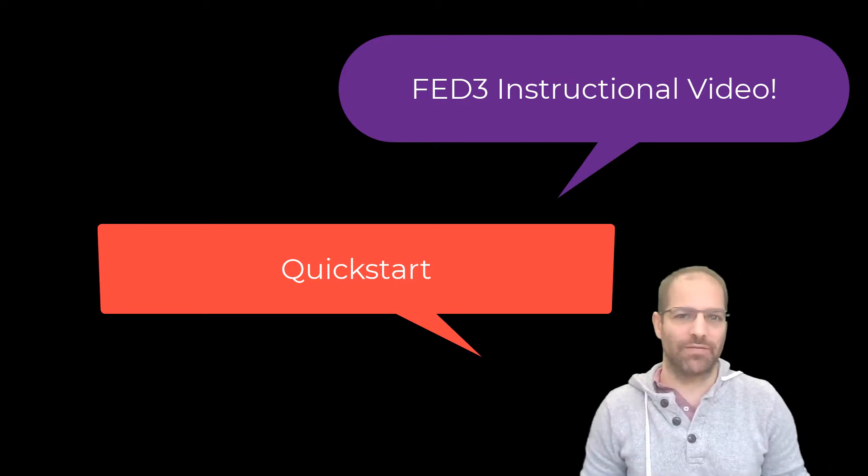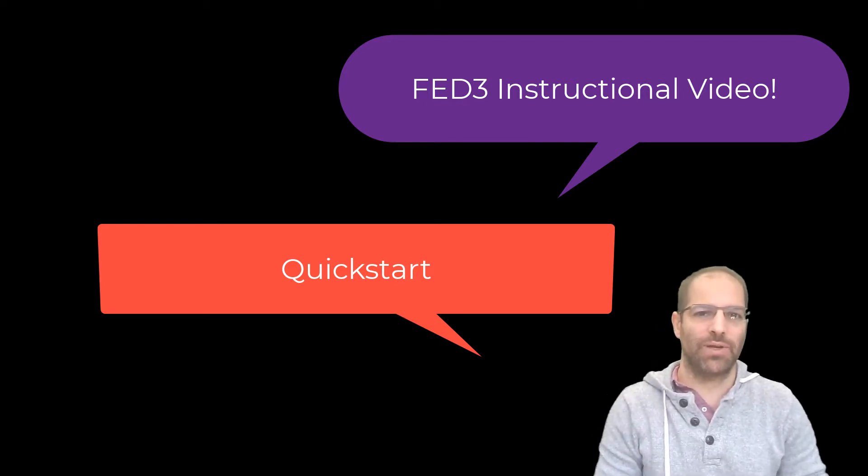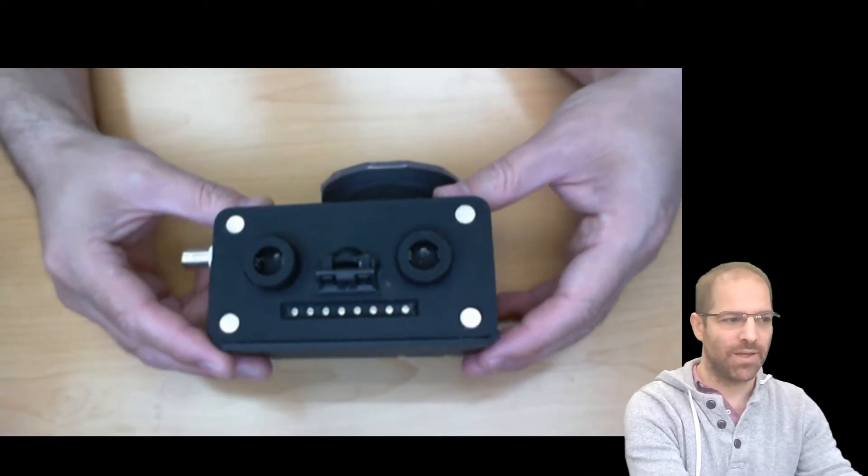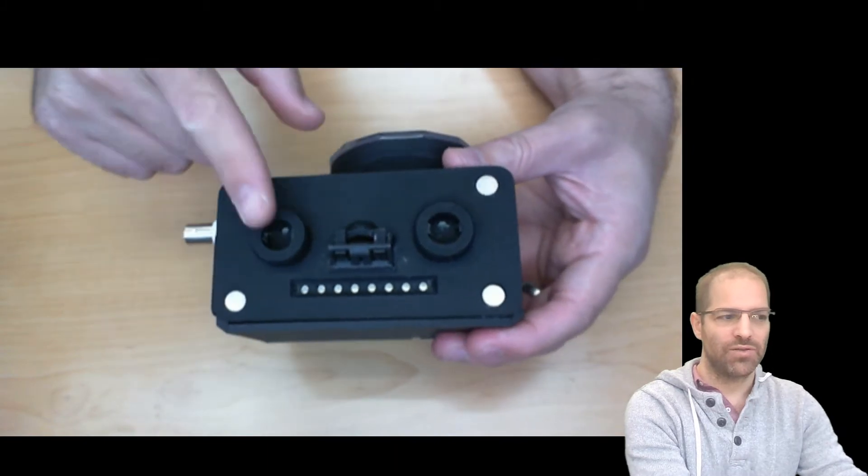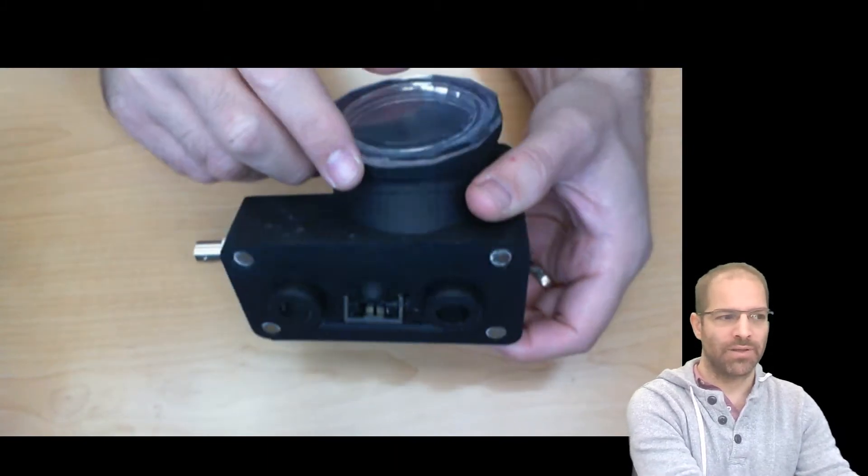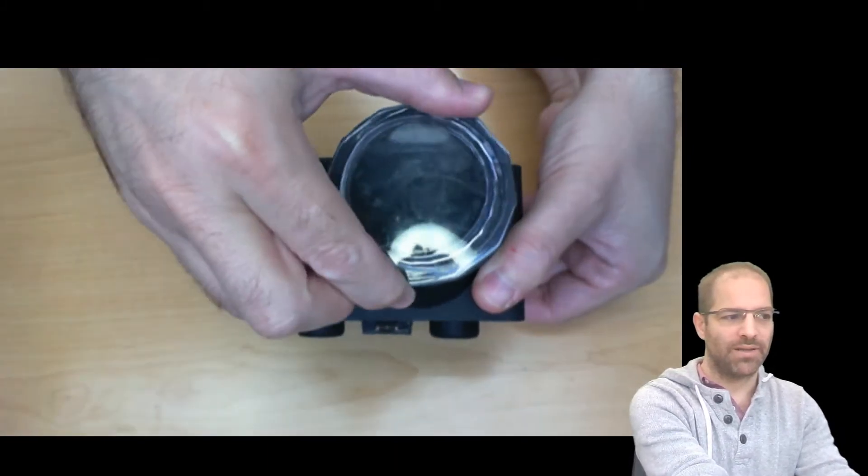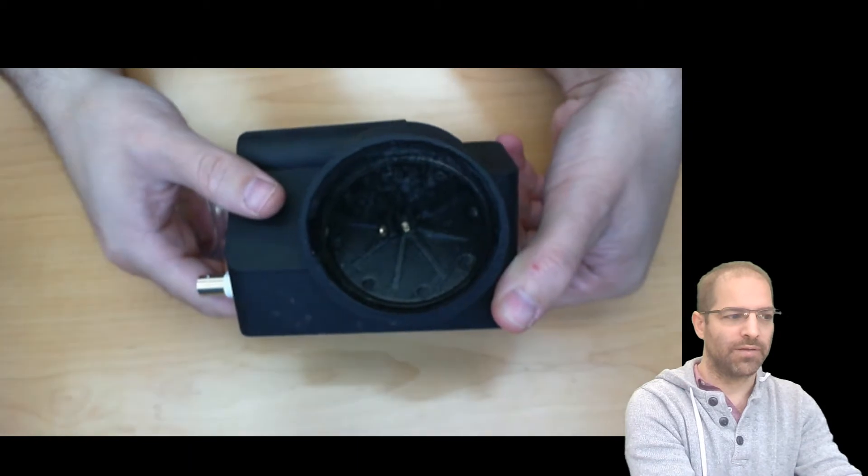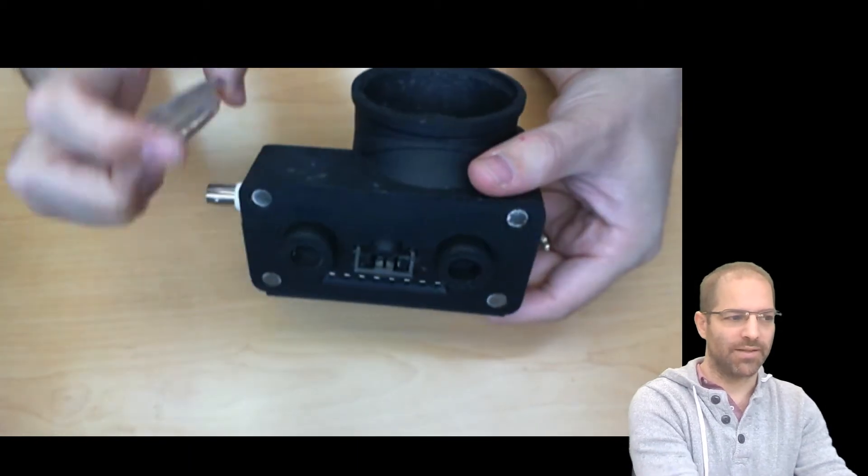This is the FED3 Quickstart video. FED3 is a smart pellet dispensing device. It has two nose pokes that the mouse can interact with, and it has a pellet dispenser up top so it can dispense pellets.